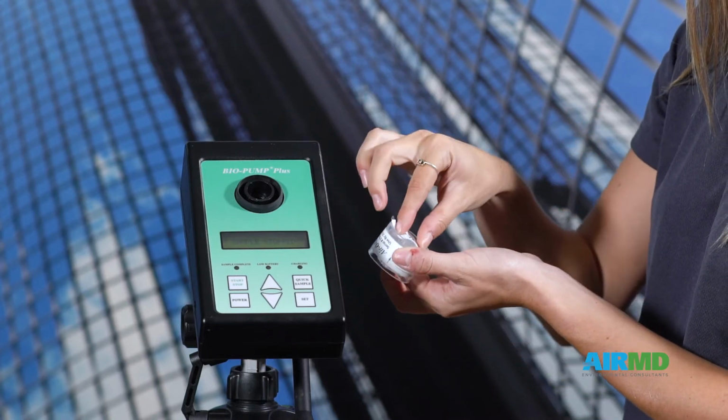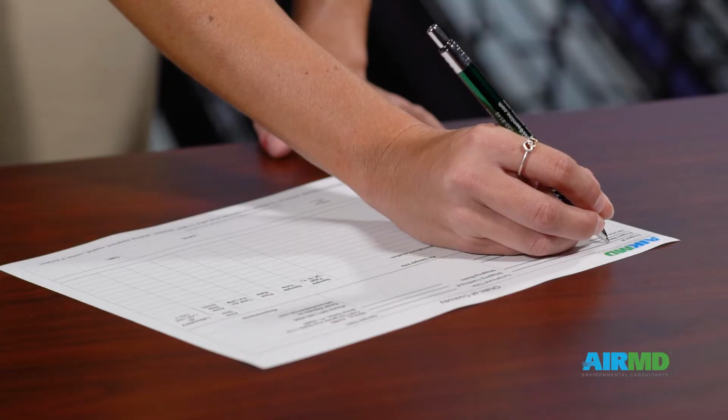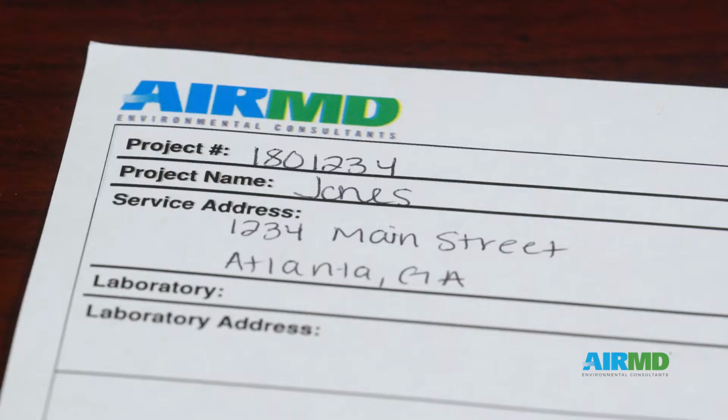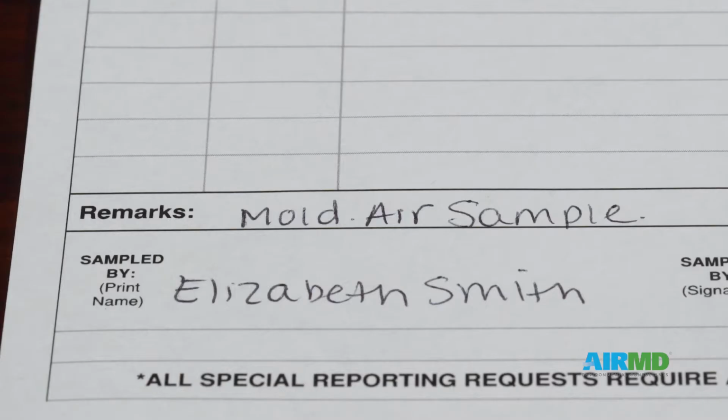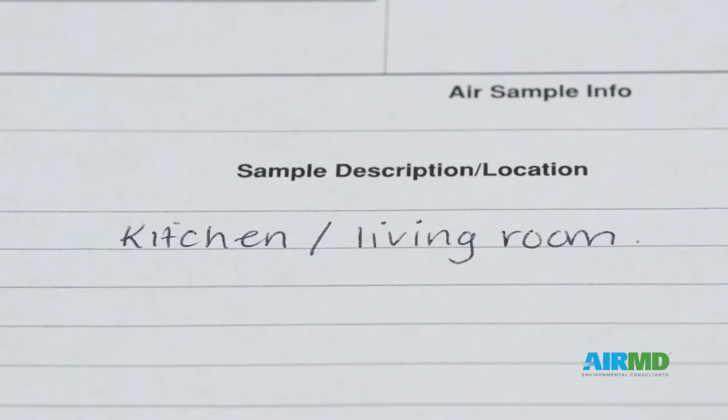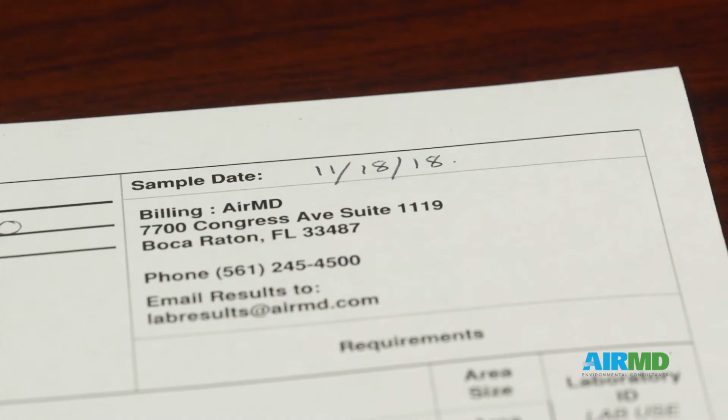After all samples are collected, the chain of custody must be completed. On the chain of custody, record the project name and number and the laboratory analysis method required. Make sure that all samples collected have the sample number, sample location, sample date, and time recorded.